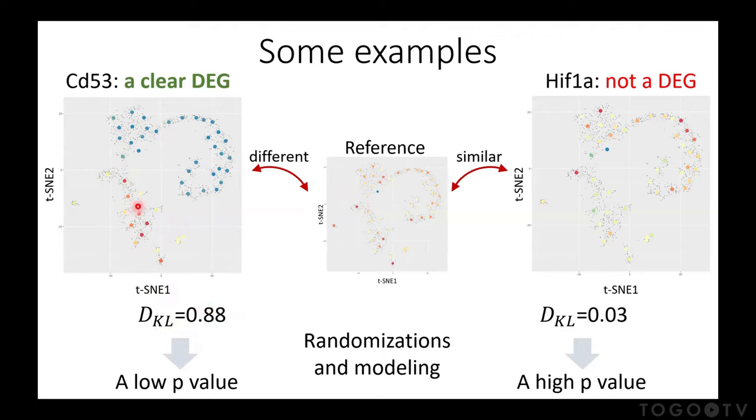But it's just noise. This gene is expressed in only one cell. So this gets a high Kullback-Leibler divergence, but the significance should be very low. That's why we do the randomization. So if you randomize such a gene, it will always get a high Kullback-Leibler divergence. So we use that to add a statistical test to it, and see if this is really high, yes or no. So if it's statistically high. I don't know if it makes sense, but.